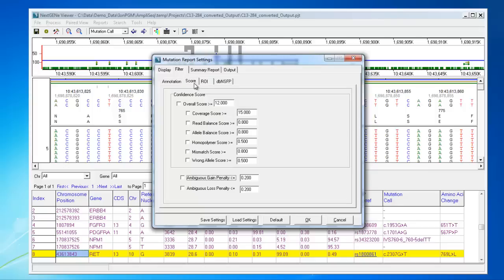On the score tab, you can choose to filter out variants with an overall confidence score below a set threshold, to remove any less confident calls.